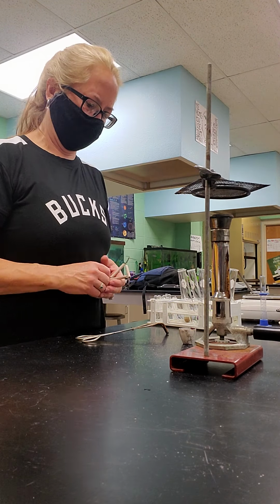Okay, in the first part, the physical properties part, we learned that sugar dissolves in water. So now we're going to take the sugar and we're going to heat it up. So we're going to be able to use, that's a little hot, another piece of equipment here. Slide that out of the way. Put this one on.